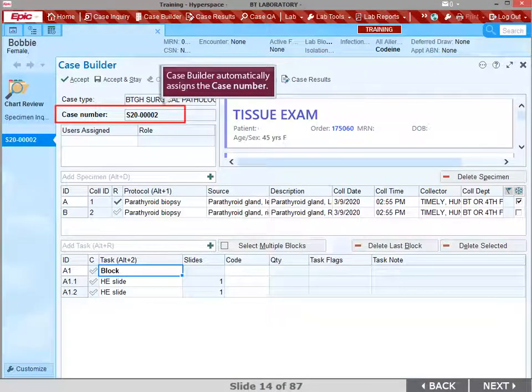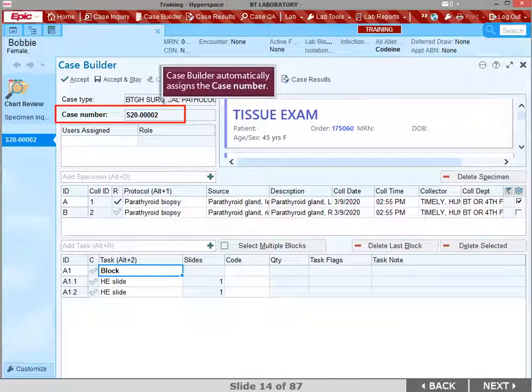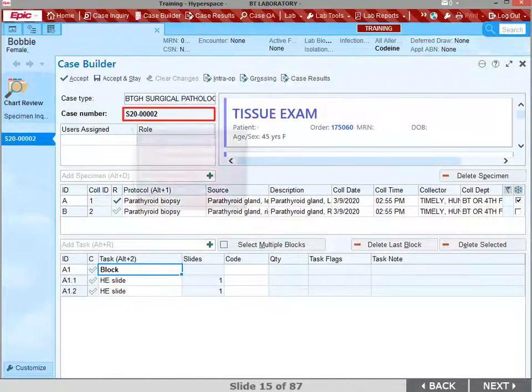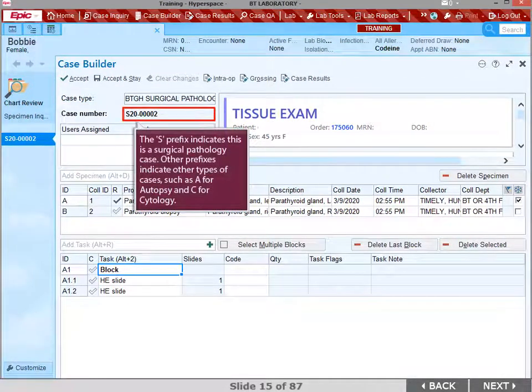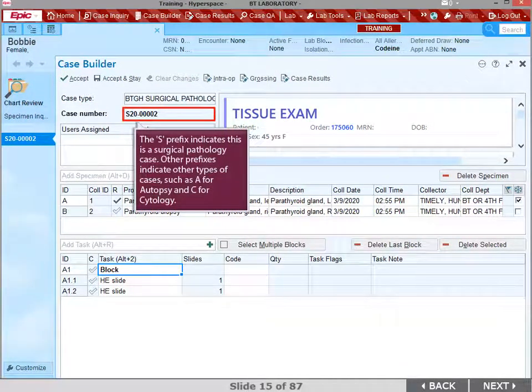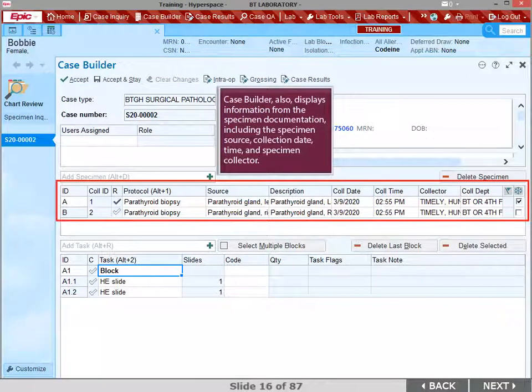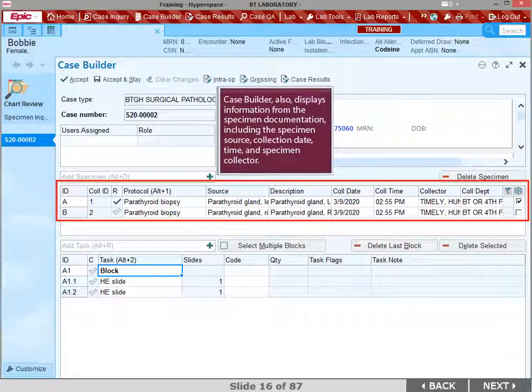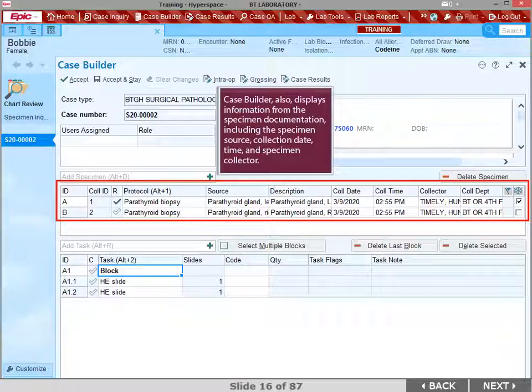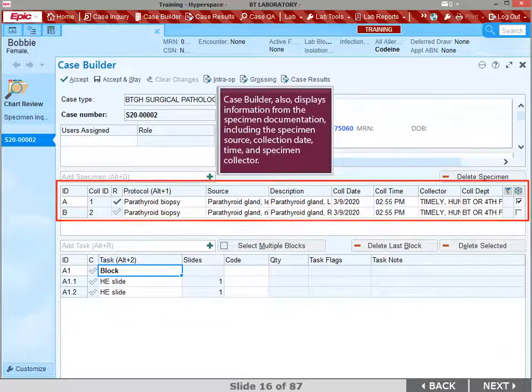Case Builder automatically assigns the case number. The S prefix in the case number indicates this is a surgical pathology case. Other prefixes indicate other types of cases, such as A for Autopsy and C for Cytology. Case Builder also displays information from the specimen documentation, including the specimen source, collection date, time, and specimen collector.